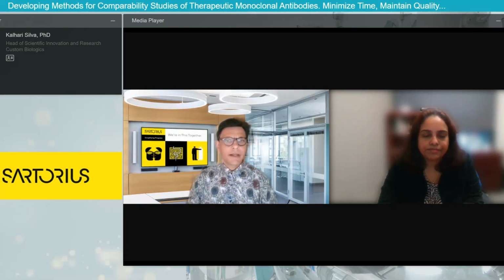Okay. And we have another question here. What are the affinity ranges you can measure? Yeah, so currently we use the Octet RED96 system. So the affinity limits in that case were 1 millimolar to around 10 picomolar in my memory, and the analyte molecular weights should be greater than 150 daltons. So I think if you search for the desired instrument and the associated data sheet, you should be able to find that information relevant to your instrument.